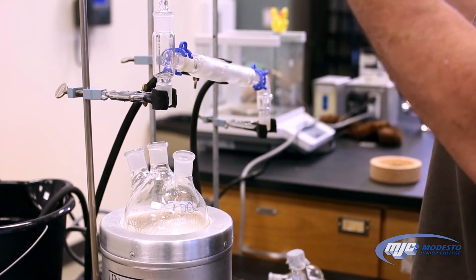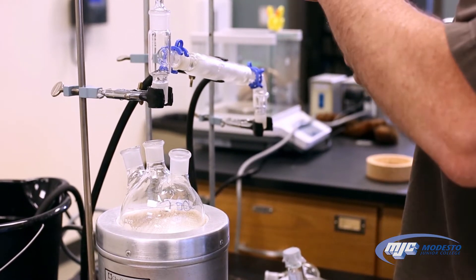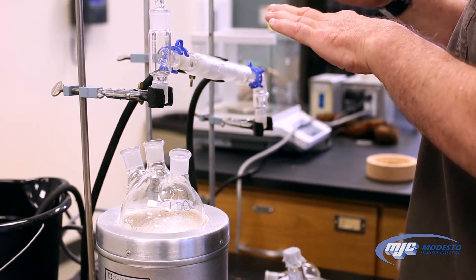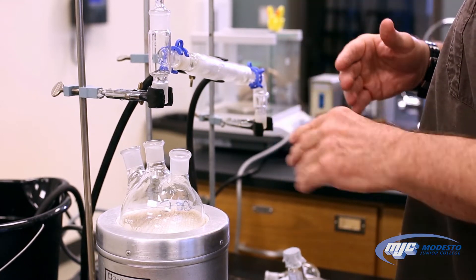Just like if you're cooking in the kitchen and you have some salt water and you leave it a little bit too long and all the water evaporates — you see that white crusty stuff left behind? Same thing here, that's the sodium chloride.